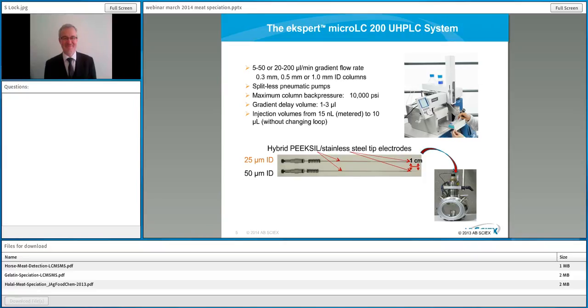And one thing which is really good and came out recently was micro-LC. This sort of sits halfway between nano-LC and high flow, but it actually simplifies the whole connection, and it gives you huge sensitivity increases compared to high flow. Basically, you're using the same source as you would use in high flow separation. All you're doing here is changing the probe and the electrode within the probe to reduce the dead volume of the system. This is to prevent peak dispersion and broadening of peaks and to improve the sensitivity.